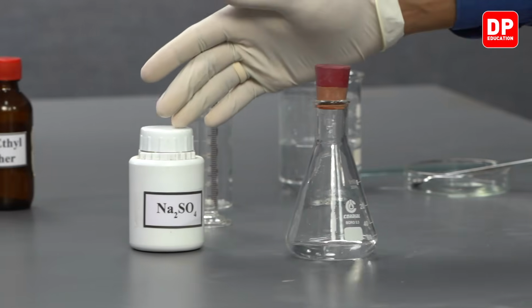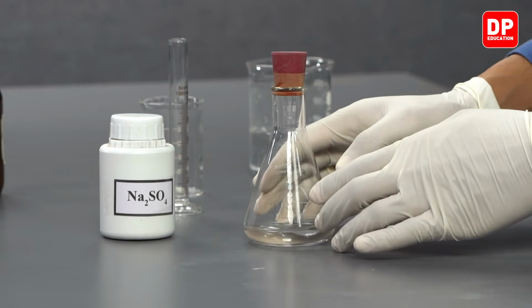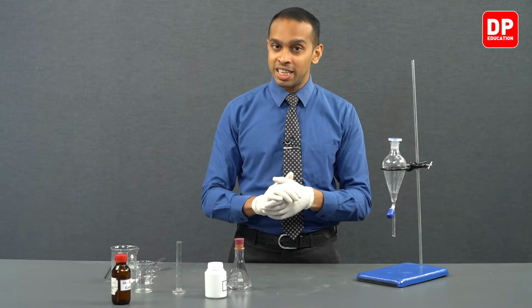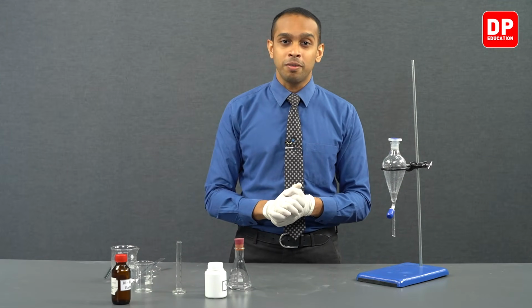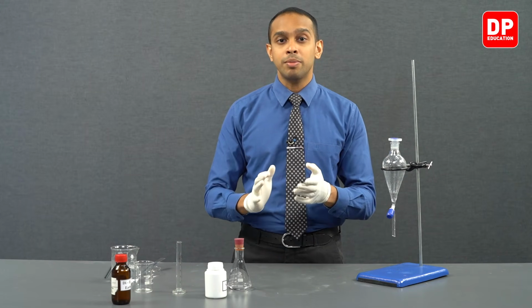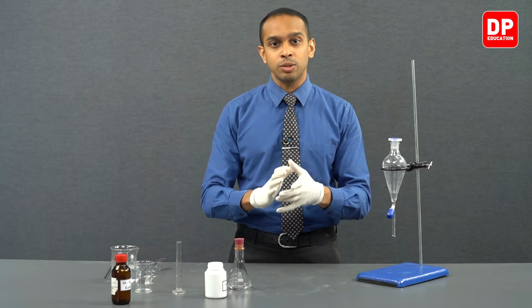So when we add sodium sulfate to our diethyl ether layer that we have separated out, if it contains traces of water, we can see this sodium sulfate clumping together. If you keep on swirling it for a while and if you add a little bit more sodium sulfate, there will come a time where the sodium sulfate no longer clumps together.